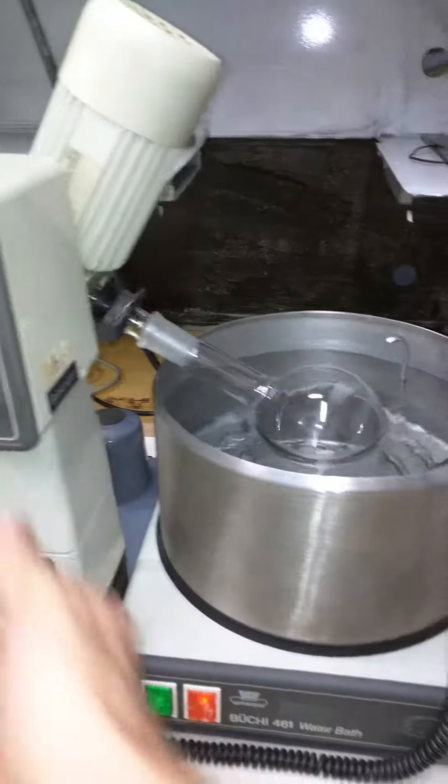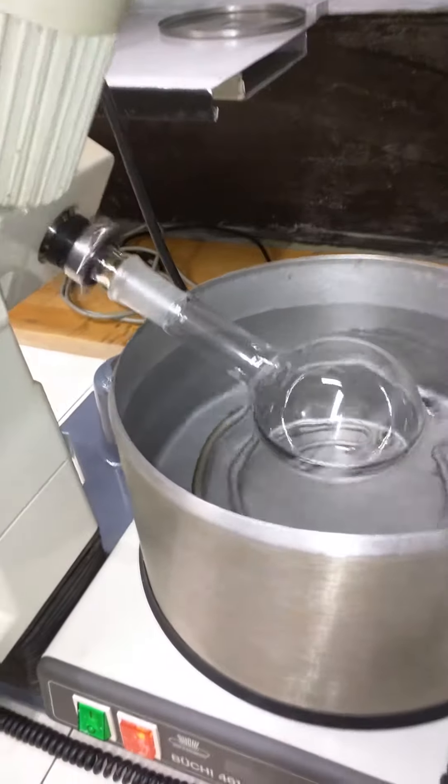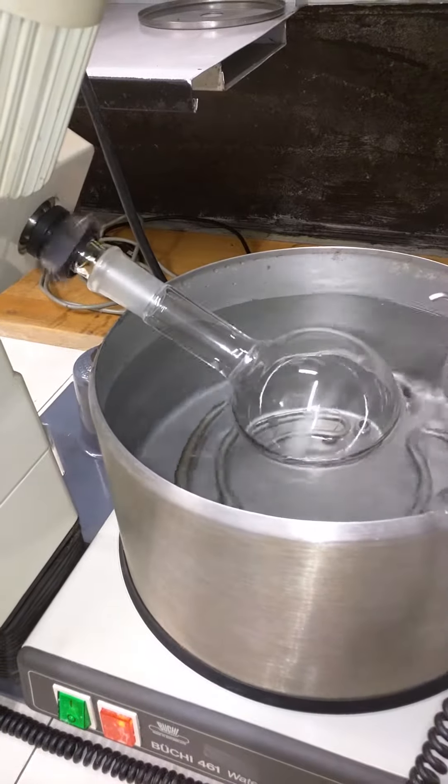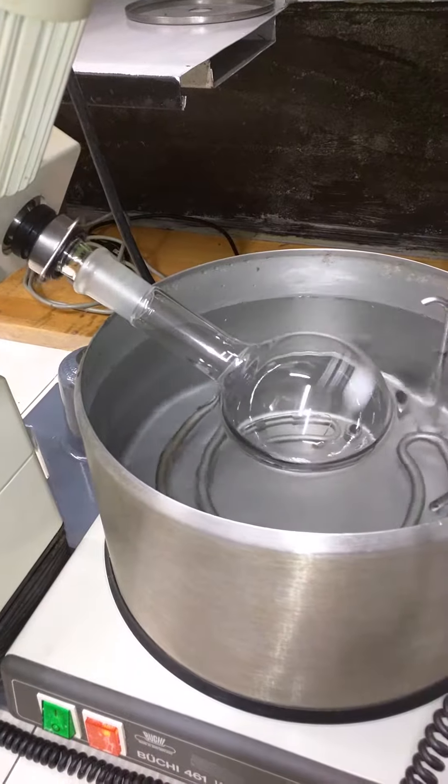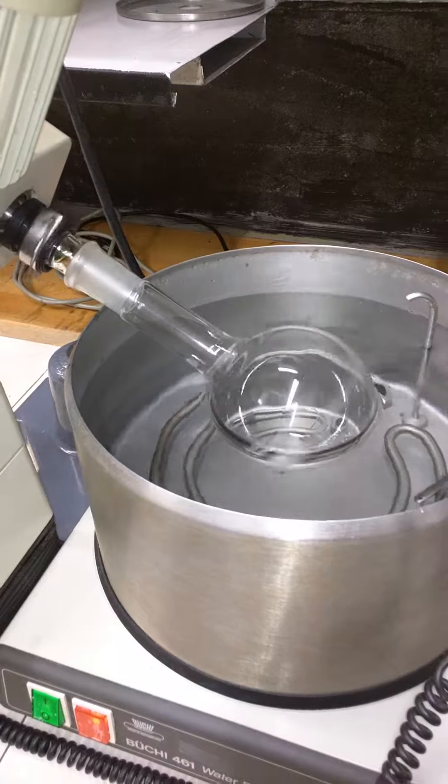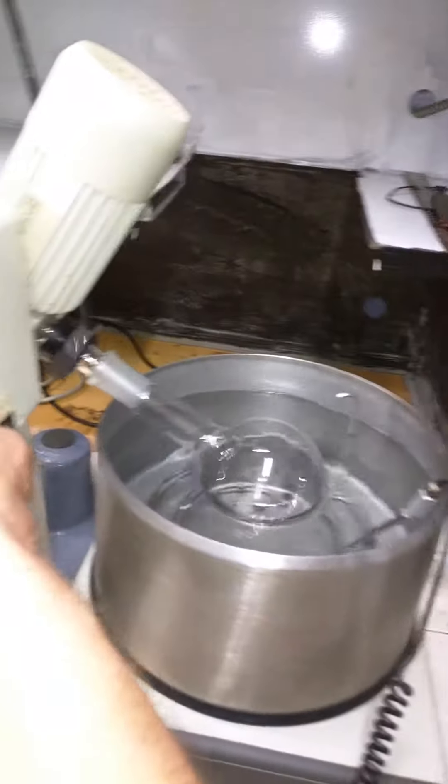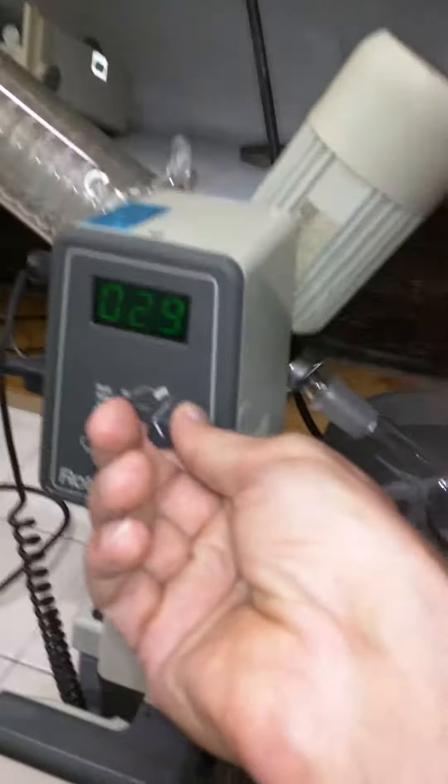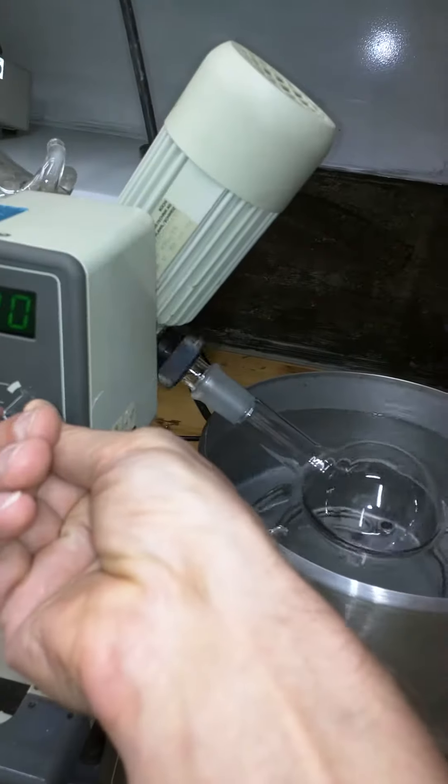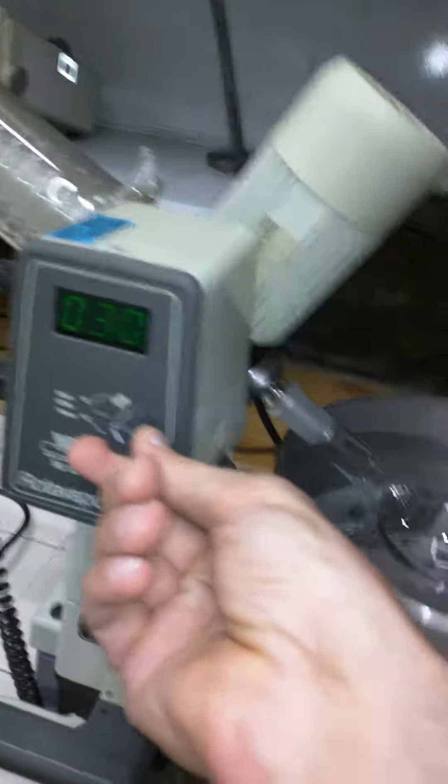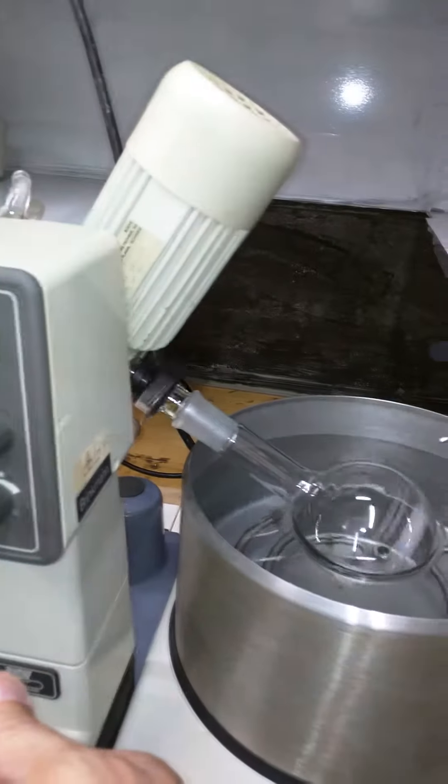As you see, we have rotation. We can take a look - it's 30 now, so it's heating up.